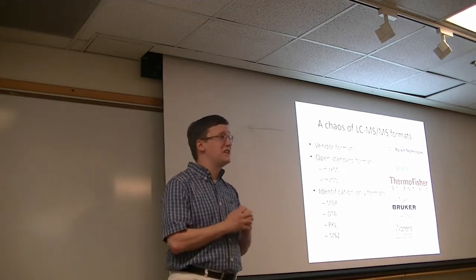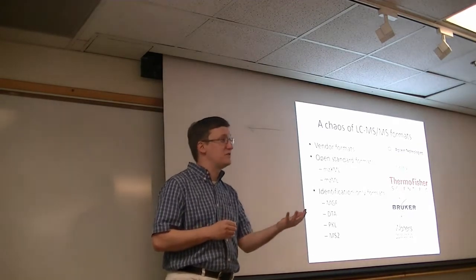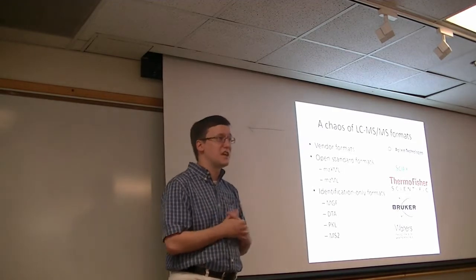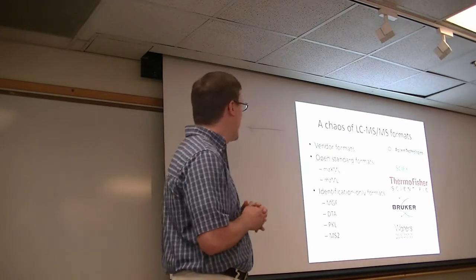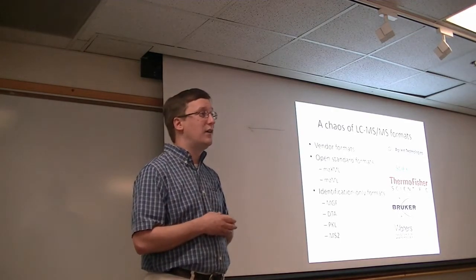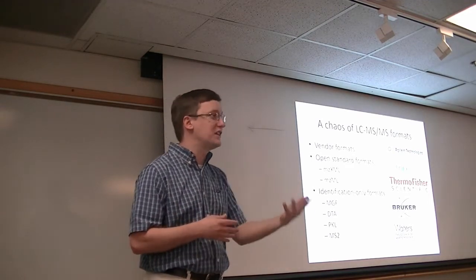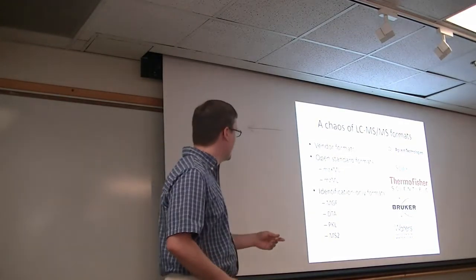In proteomics, we're frequently dealing with identification, so exporting piles of tandem mass spectra to our hard disks and being able to read these and identify them is kind of a priority. And so we see that there are lots of formats that have evolved around that. MGF, for example, is the Mascot Generic File. It's a format created for people who use the Mascot identification software from Matrix Science.